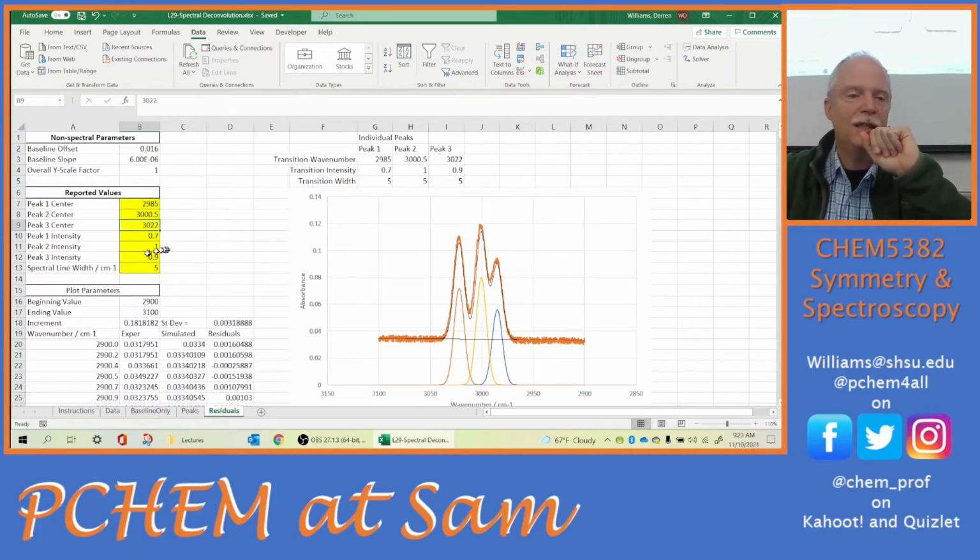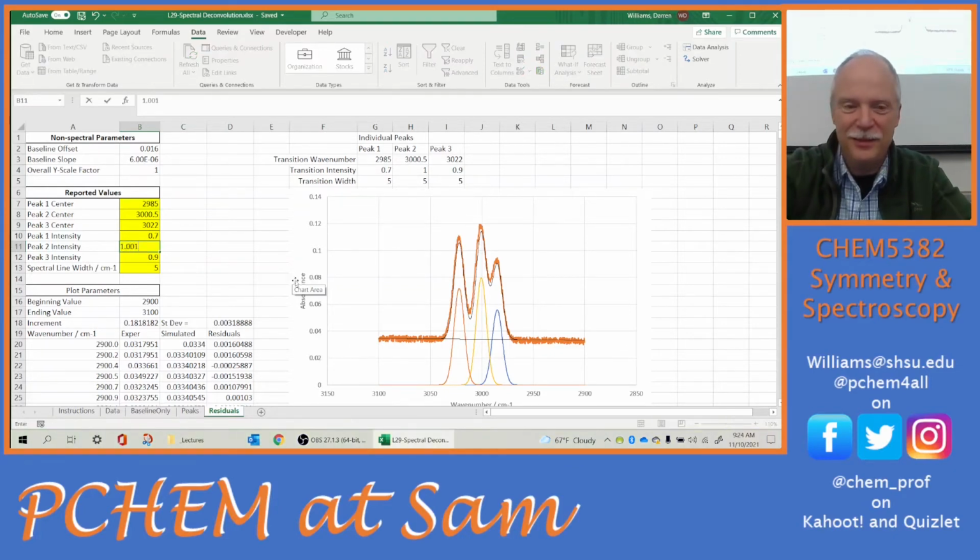So let's raise its intensity for peak 2 from 1 to what? What do you want? You choose. Okay, put 1.001, so tiny change. Okay, we'll try it. 1.001, no problem. All right, let's see what happens to our standard deviation. We're at 0.00318.